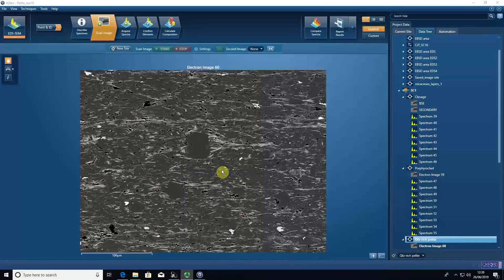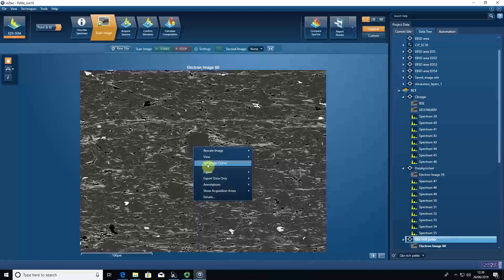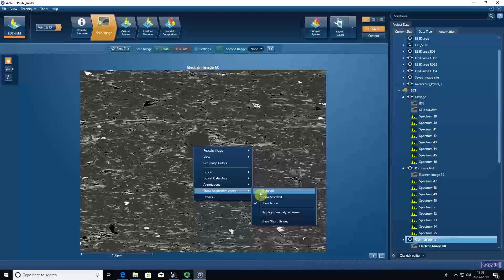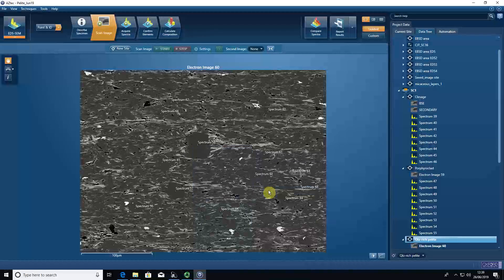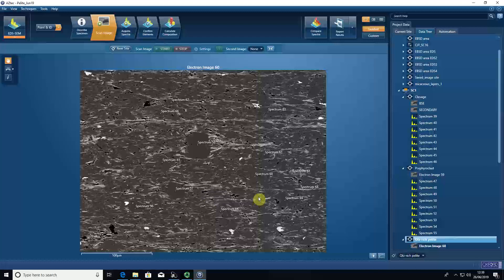In order to do that, I recommend turning on the acquisition areas, so we show all, and we can see where the spectral locations are.